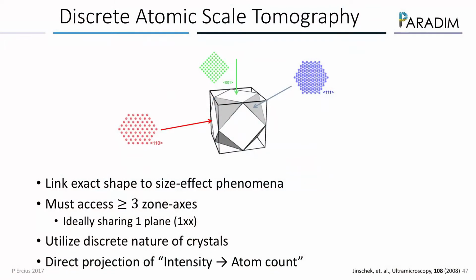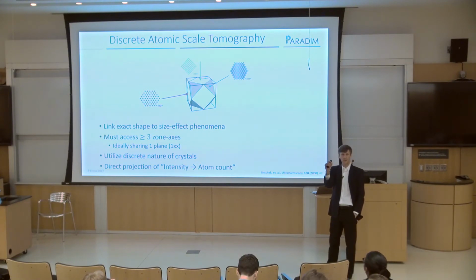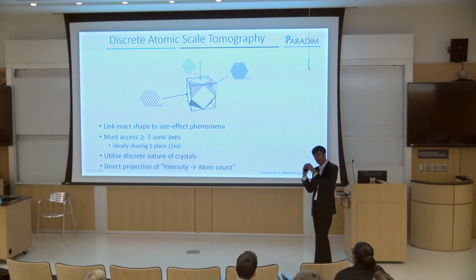And then I'll talk about a completely different kind of reconstruction technique that people are pushing in order to get to atomic resolution, right? So what you can look at is this object. You can assume that atoms are discrete, right? Nuclear physicists care what's inside the atom, right? But the basic building block of material science is the atom. We don't really care what's inside the atom as much, right? You care that that's a titanium atom, or you care that that's a type of atom.